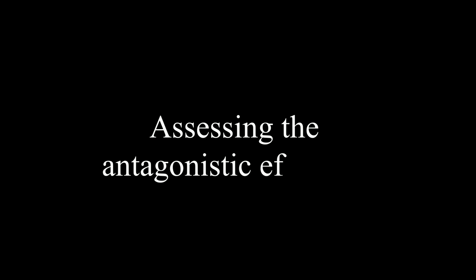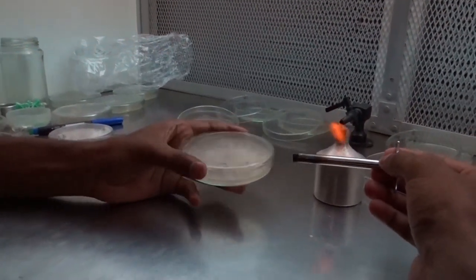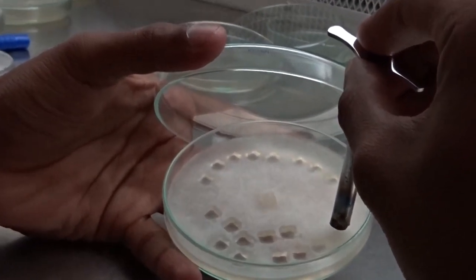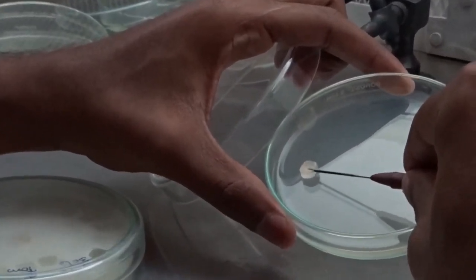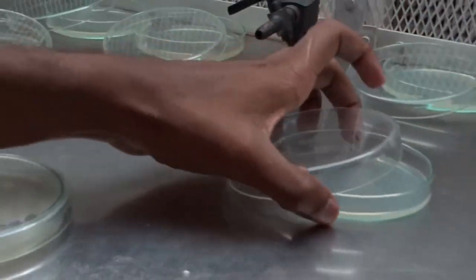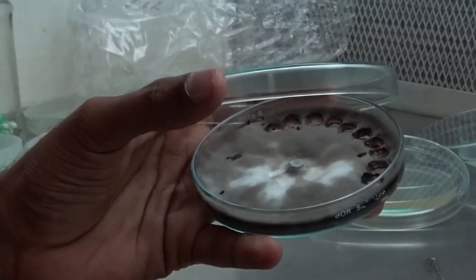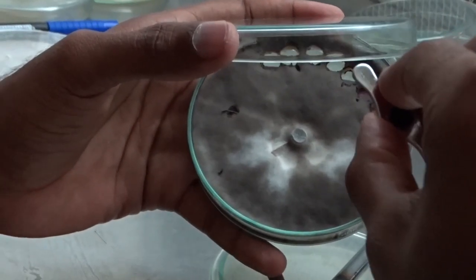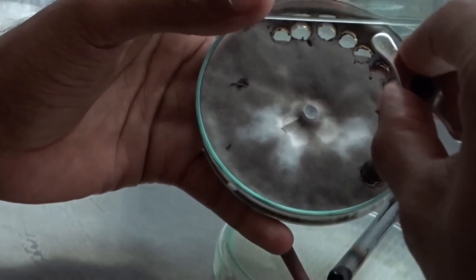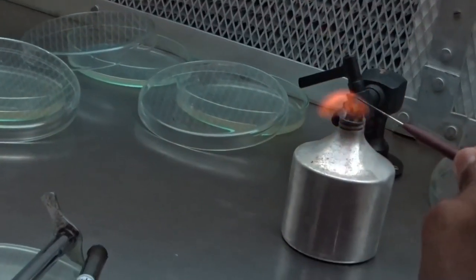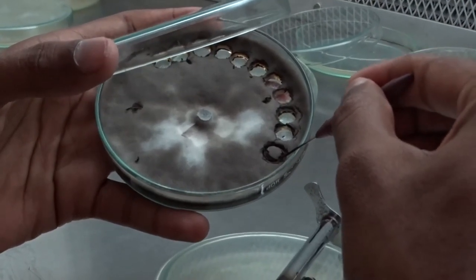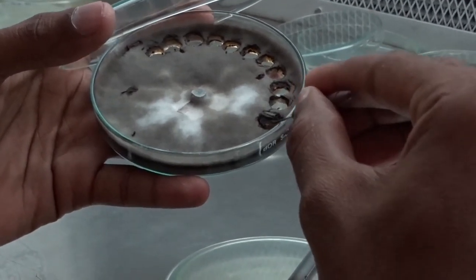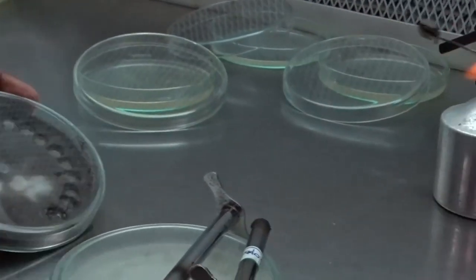Assessing the antagonistic efficacy using the dual plate technique. Make an 8 mm mycelial disc of Macrophomina using a sterile cork borer. Place the mycelial disc of Macrophomina at one side of the petri plate, 1 cm away from the edge of the plate.